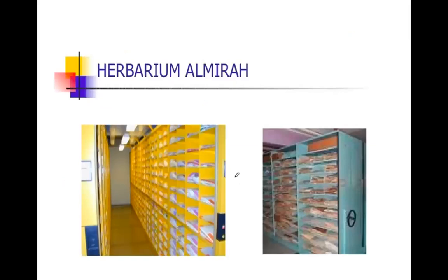Okay, so these are the herbarium cabinets. The specimen sheets are filed inside folders, which are of various colors indicating species, genus, family, and geographical area. In most of the Indian herbaria, the specimens are arranged according to the Bentham and Hooker classification.